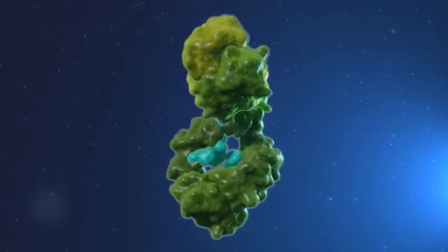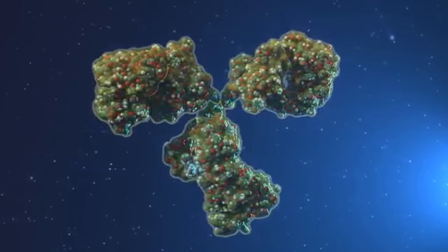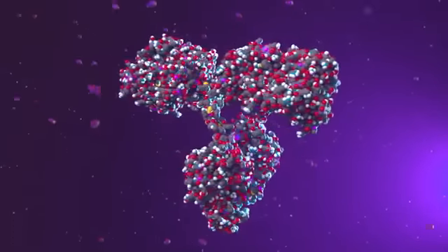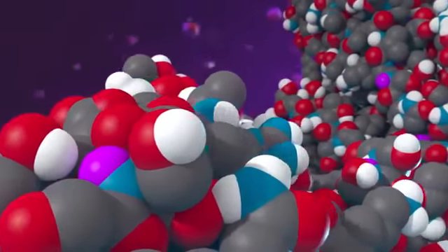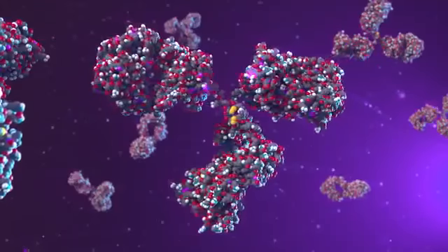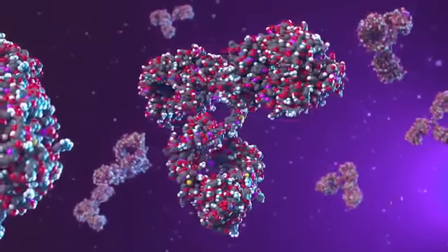Hydrogen deuterium exchange with mass spectrometry, HDX-MS, is a powerful method for assessing and comparing higher-order structure. If the protein is exposed to heavy water, it will begin to accumulate deuterium. The hydrogens on backbone amide groups exchange with deuterium at a rate that depends on solvent accessibility and involvement in hydrogen bonding. With careful control of experimental conditions, this allows reliable and reproducible study of conformational dynamics.